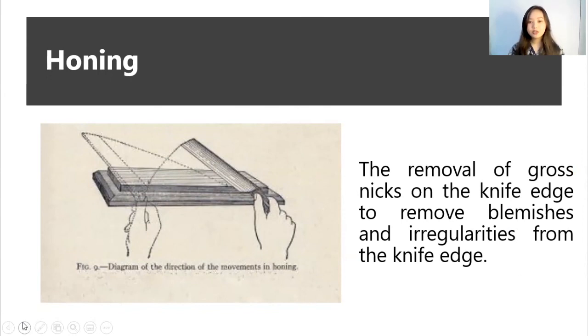It is heel to toe. The knife should be fitted to its corresponding knife back and should be placed on one end of the hone. With the cutting edge first, the heel or the handle end is drawn obliquely or diagonally towards the operator on the stone until the toe or the head portion is reached.